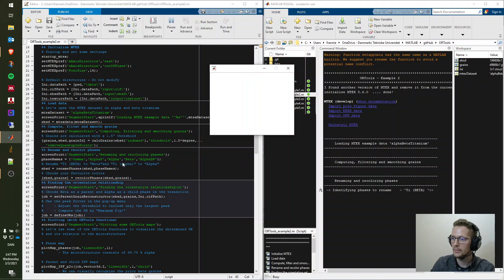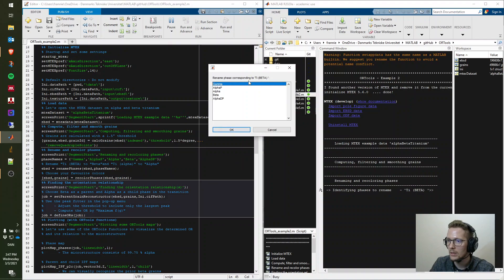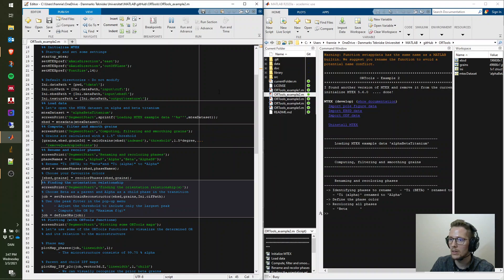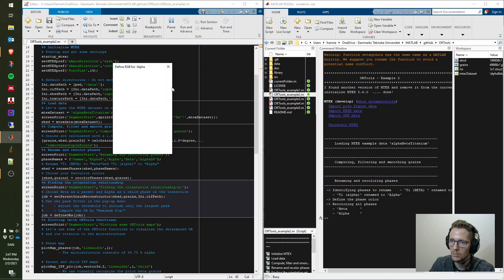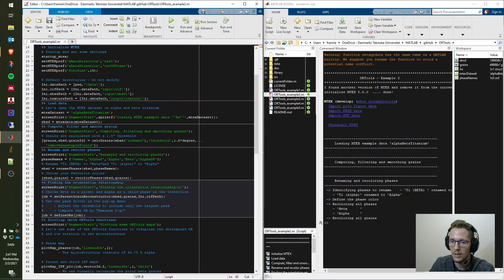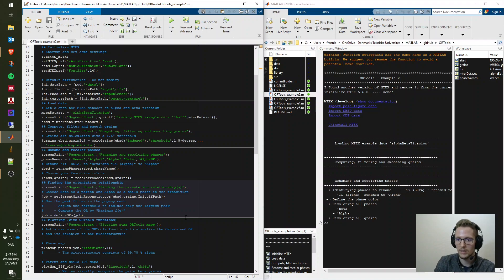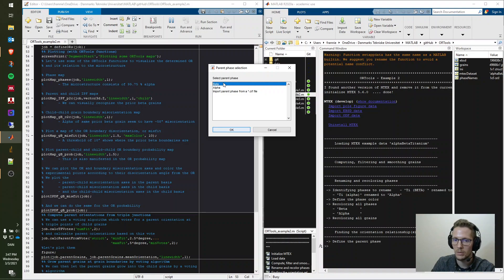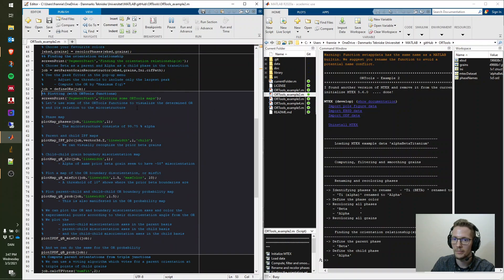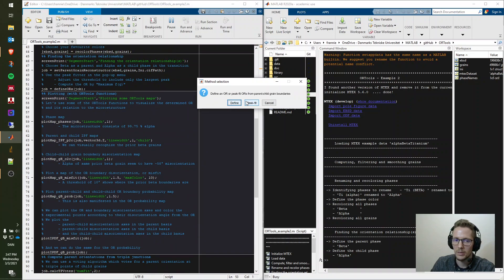Ti-beta gets renamed to 'beta' and Ti-alpha to 'alpha'. We choose colors: green for the beta phase and dark red for the alpha phase. Then we initialize the parent grain reconstructor by specifying the grains, the EBSD data, the parent phase (beta) and the child phase (alpha). It then asks how we want to define the orientation relationship.